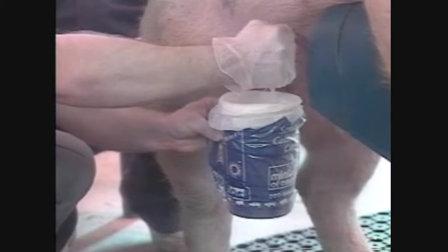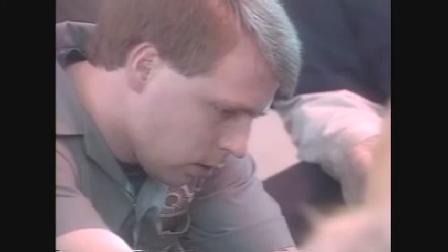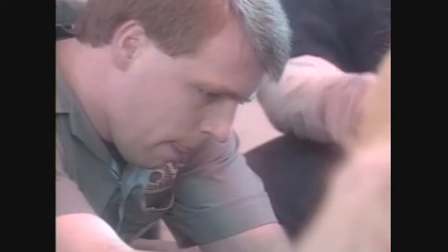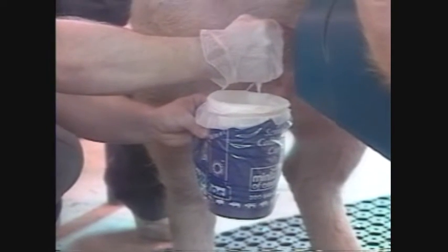Semen collection requires patience and an empathy with the boar. The boar must always feel secure in the collection pen. Every effort should be made to ensure that no potentially distressing or traumatic procedures are performed in this area. For example, blood sampling, vaccination, or tusk trimming. Ideally, the person who performs such unpleasant procedures should not be one of the regular semen collectors.